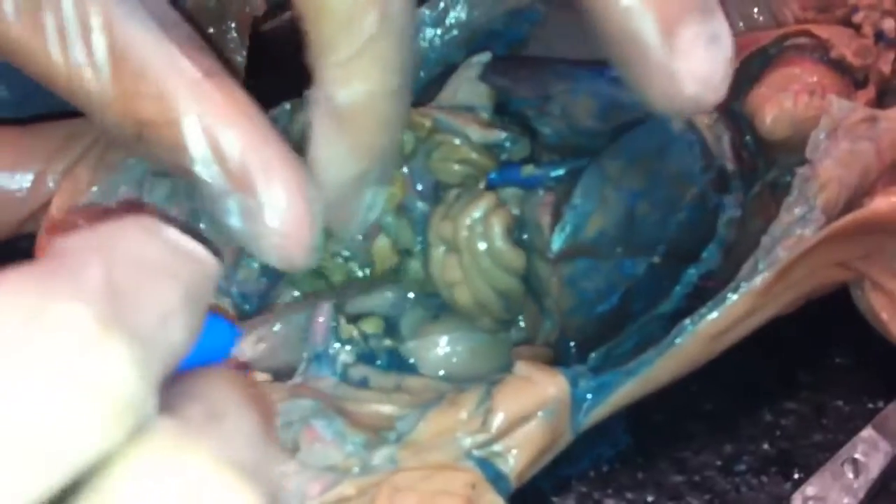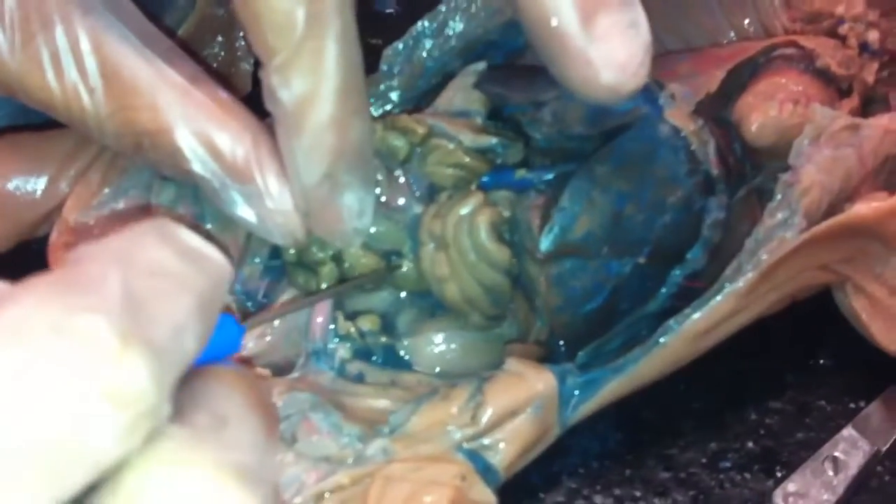Now the cecum. The cecum is right here — the colon to the intestines. Actually the cecum is back here, and that thing right there. And then the colon is here.